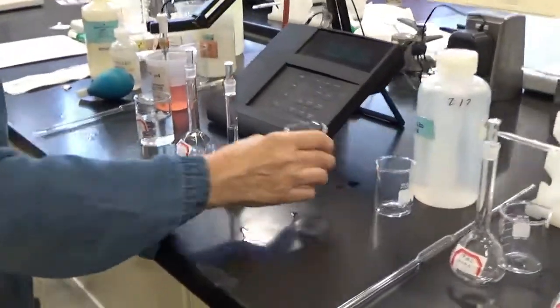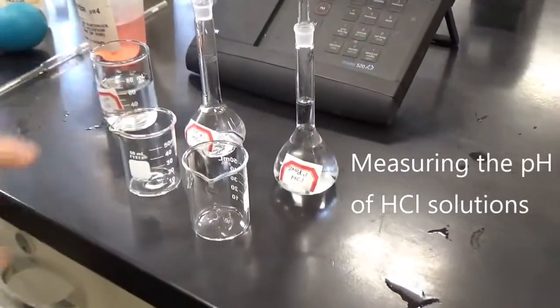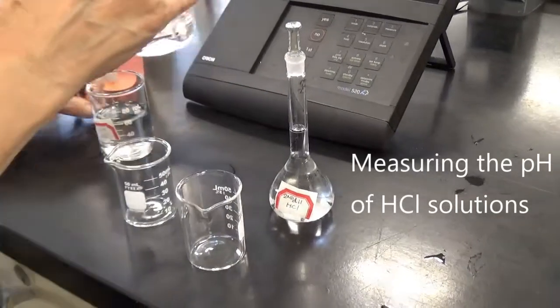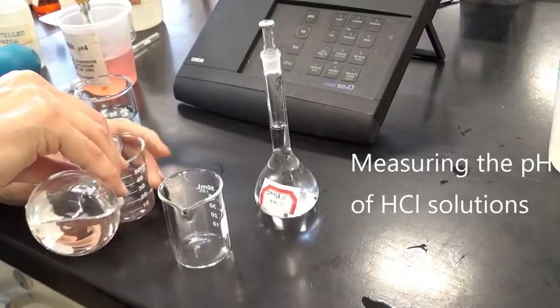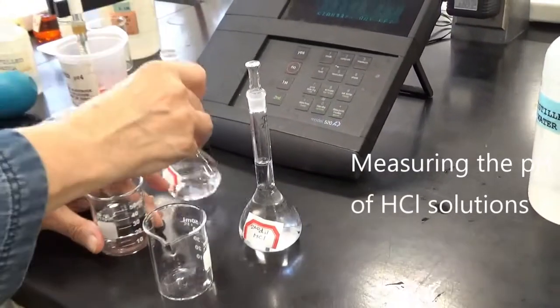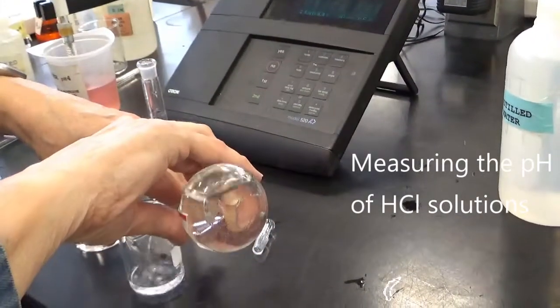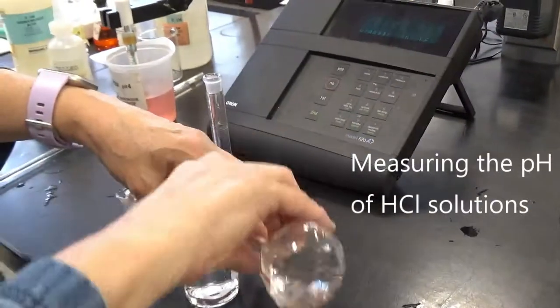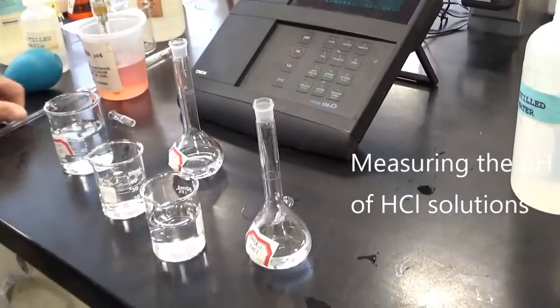And I'm going to transfer some of each of these into these 2 beakers, and then I'm going to measure the pH. Previously, I actually calibrated the pH meter by using 2 different buffer solutions, so I know that it's going to give me pretty accurate readings. That's probably enough. Okay, so I have my 3.